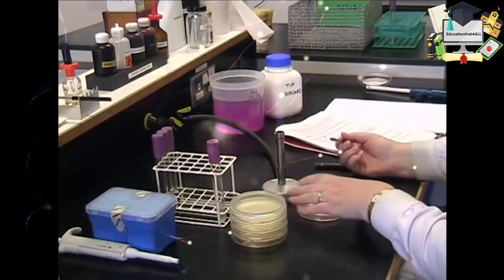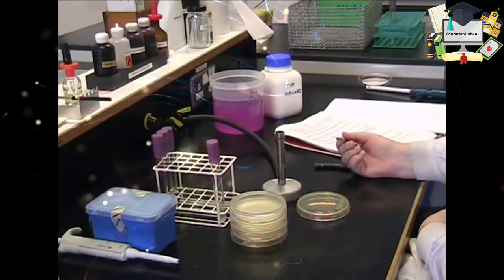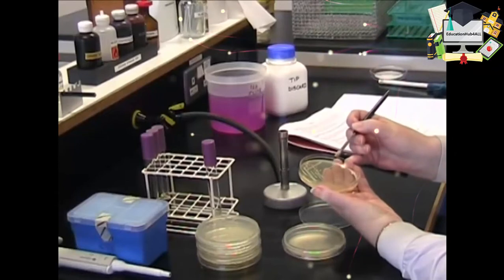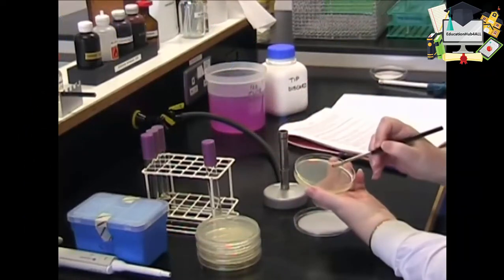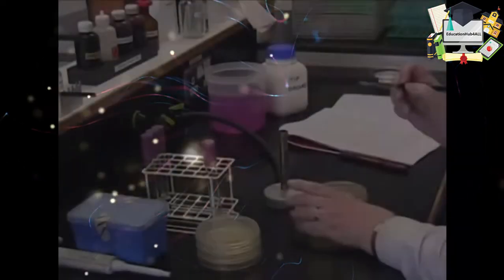When the plates are incubated, they're always incubated lid side down to avoid condensation appearing on the surface of the agar. Take a well-isolated colony from your plate with a cool, sterile loop. Place the agar plate onto its lid. Take a fresh plate and streak as we've shown in the other video clip.